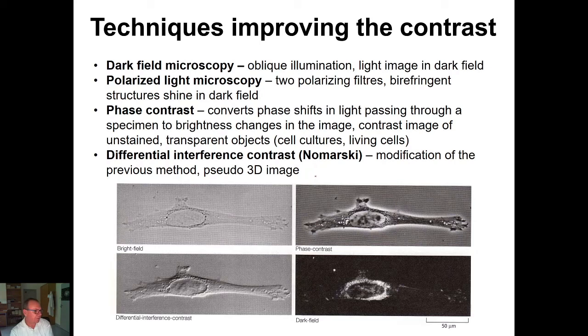Histology is a domain of the sections, of the stained sections, but cell biology and the research in the field of cell biology is based mostly on observation of living cells in a light microscope.